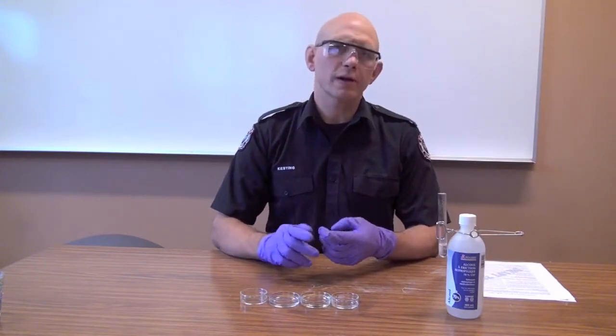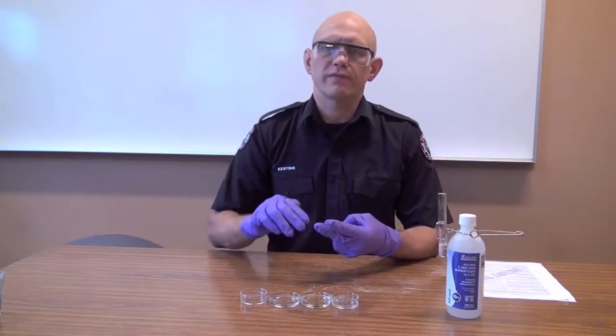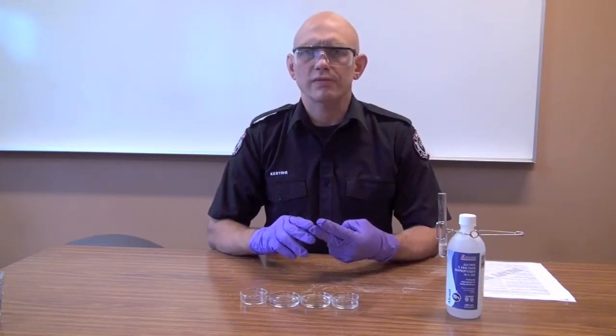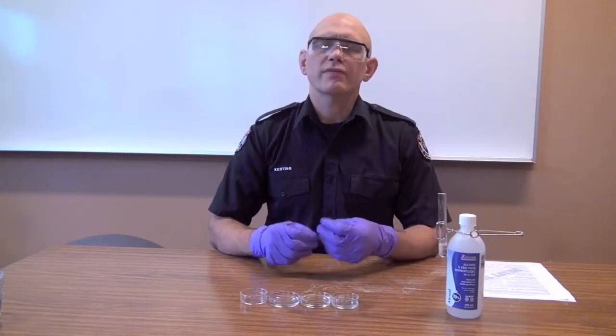The first thing you're going to mix your liquid with is water, and we do this for a couple of reasons. We want to find out whether it's soluble or not, whether it floats or sinks, what the specific gravity is — whether it's greater than one or less than one — and we want to find out if it's water reactive.